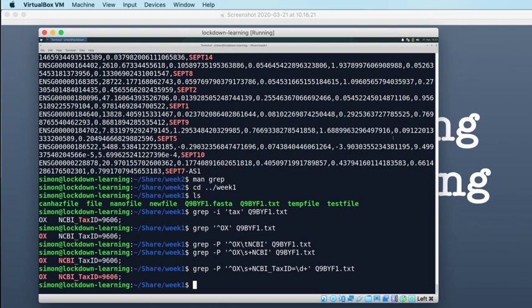find this matching line and then extract those numbers using a second grep. And you do that using output redirection. So we've got this grep which matches the line. So this returns just a single line, which gives us the NCBI tax ID. But maybe we want just the number, and to do that we can redirect that single line, so the one line that results from that particular grep, and we can use a second grep to extract just the number.